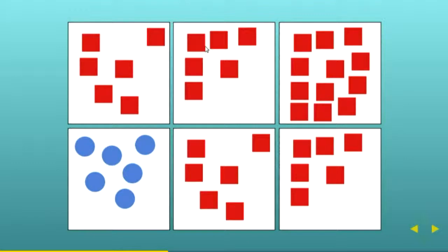In my study, I'm going to completely miss that phenotype on the bottom left-hand side where you've got circles because it's the exact same area and the exact same count as the rest of the samples in the study. And that result there could be a Nature paper, that could result to a Nobel Prize. So if you're only focusing on a couple of parameters and miss that, you've played yourself, as the kids say these days.